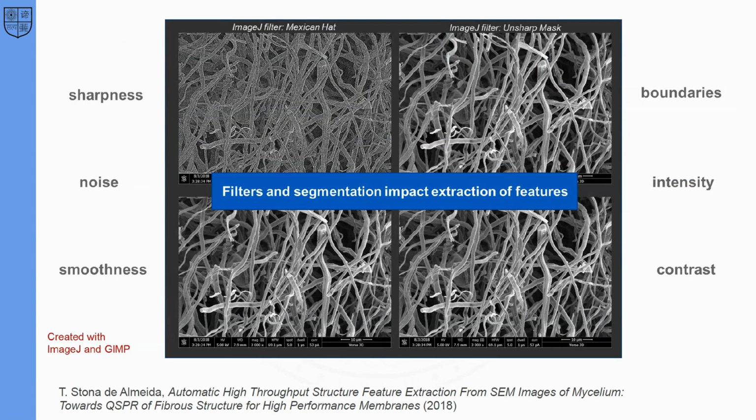The challenge of characterizing biofibrous material is that, unlike man-made electrospun nanofibers, natural fibers tend to be complex, curly, non-linear in their features. This means that any tools for artificial fiber characterization based on images will fail to capture the tortuosity and other details of the natural network. I tried to experiment with different image filters to segment the image from scratch, but it was not successful.